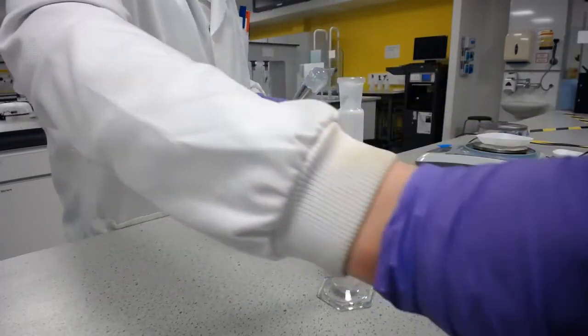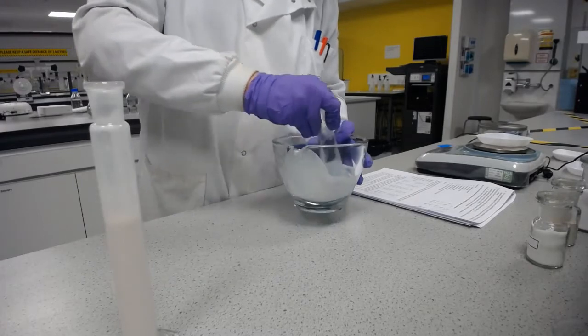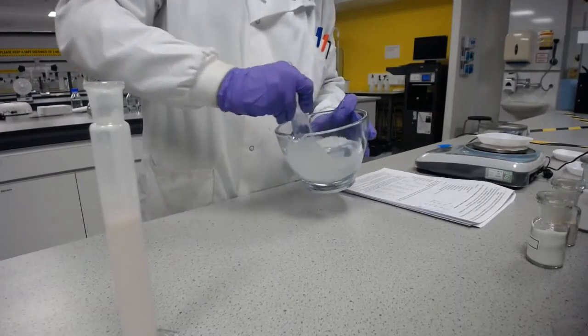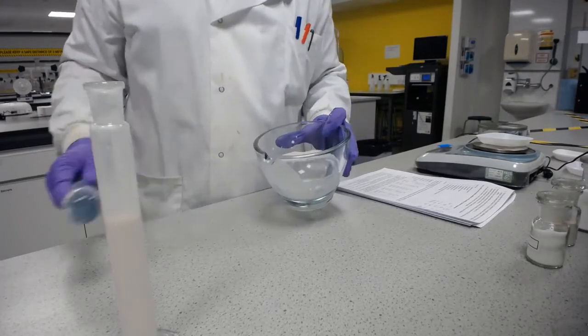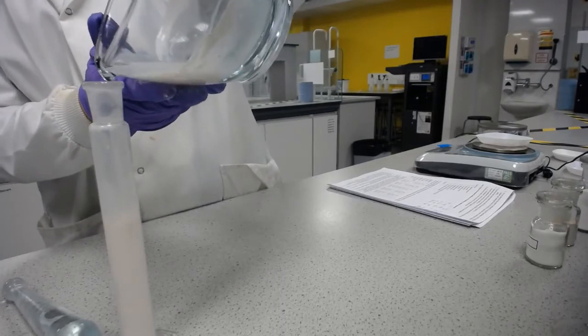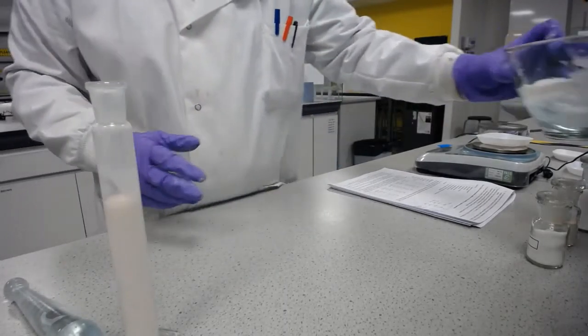And that's the last bit, which I can do my final rinse with. And I'll be up to 50 millilitres. There we go.